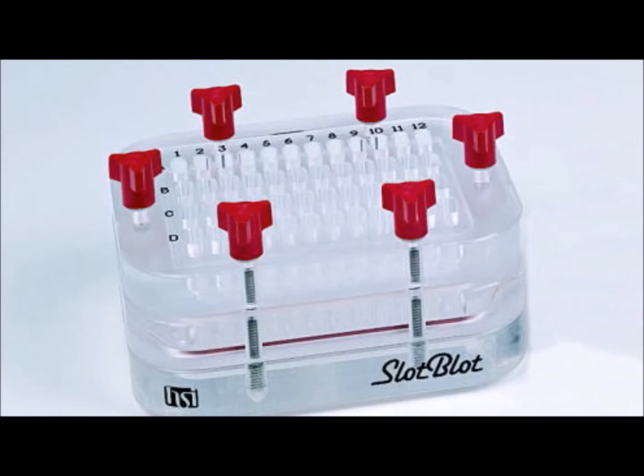Slot blot. This method is based on the specific hybridization of a 40 base pair probe that binds to the human alpha satellite locus. Using this technique, DNA is quantified by visual comparison of sample band intensities with band intensity of standards, produced from known amounts of DNA.